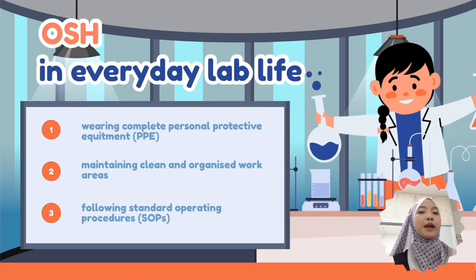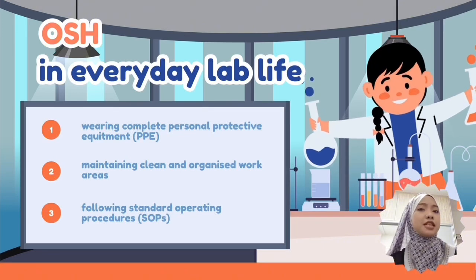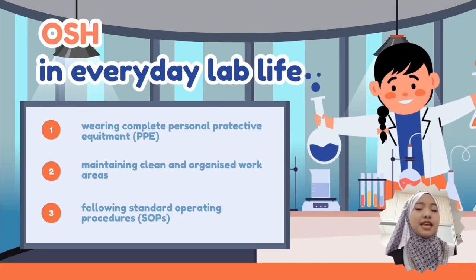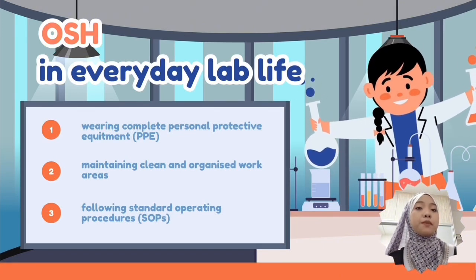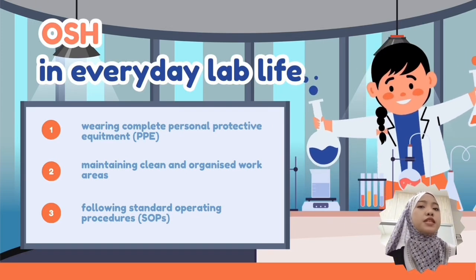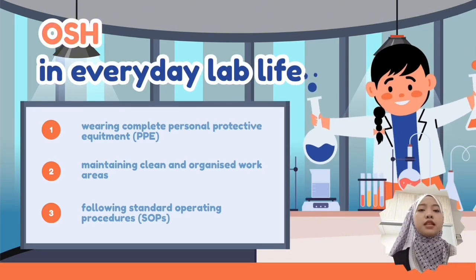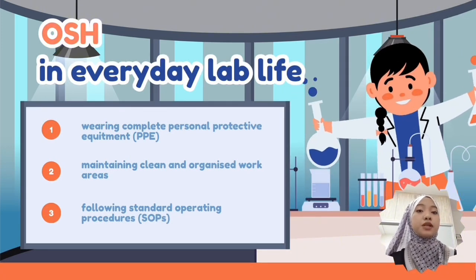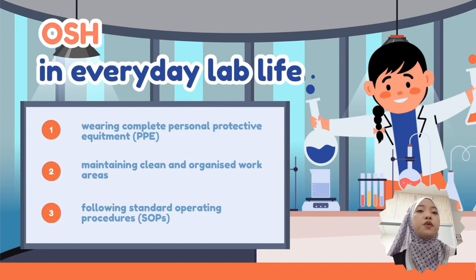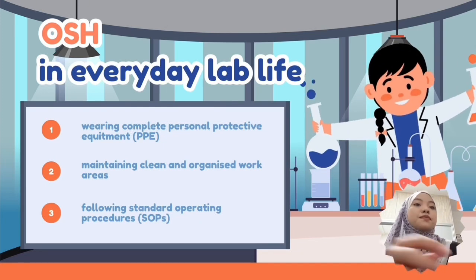OSH in everyday lab life. In everyday laboratory activities, OSH can be seen through simple but important practices. These include wearing complete personal protective equipment, maintaining clean and organized work areas, following standard operating procedures, and using laboratory equipment responsibly. By applying OSH principles consistently, risk in the laboratory can be significantly reduced.